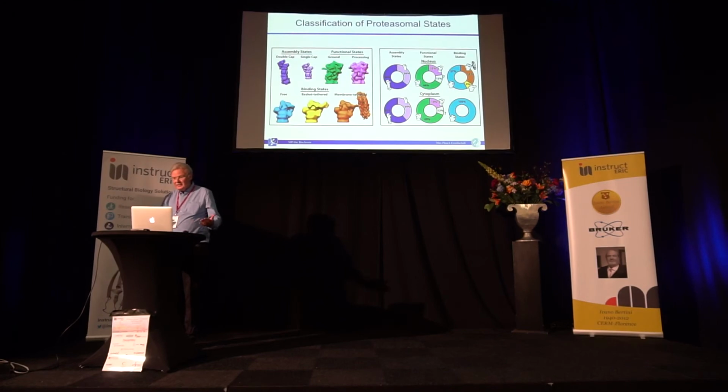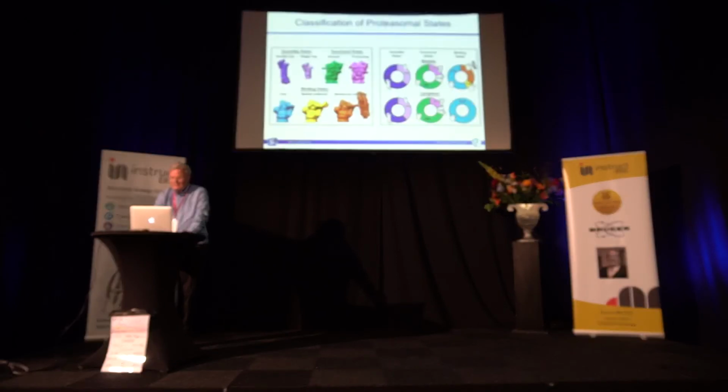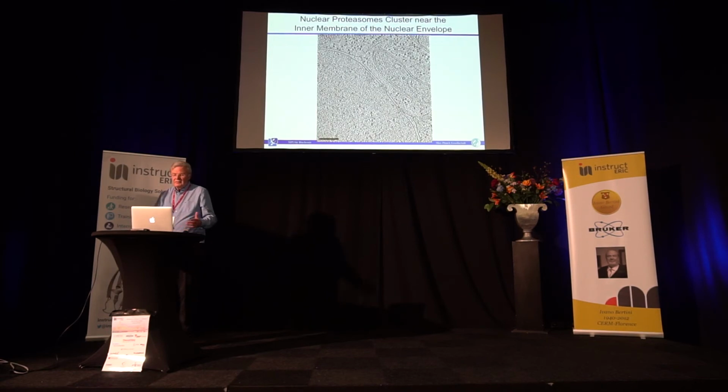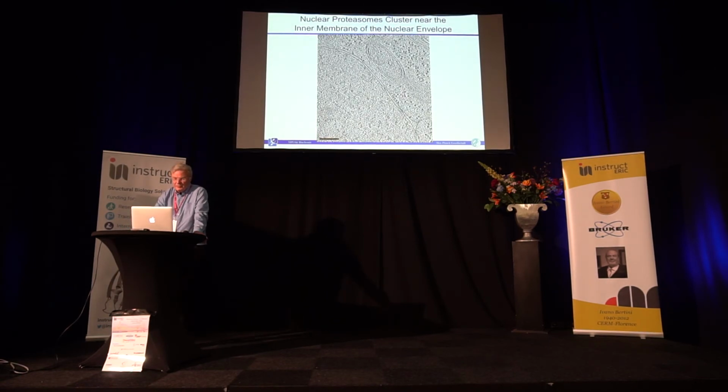Some are free, not interacting with anything. We can see in the tomograms whether they are interacting with a nuclear basket or whether they are membrane tethered. And we can very nicely quantify that, showing, for instance, that most of the particles are double capped, and that under these conditions of the experiment, 60% are basically in the ground state, sitting there and waiting for substrate. Now, we can map them back to the tomogram.